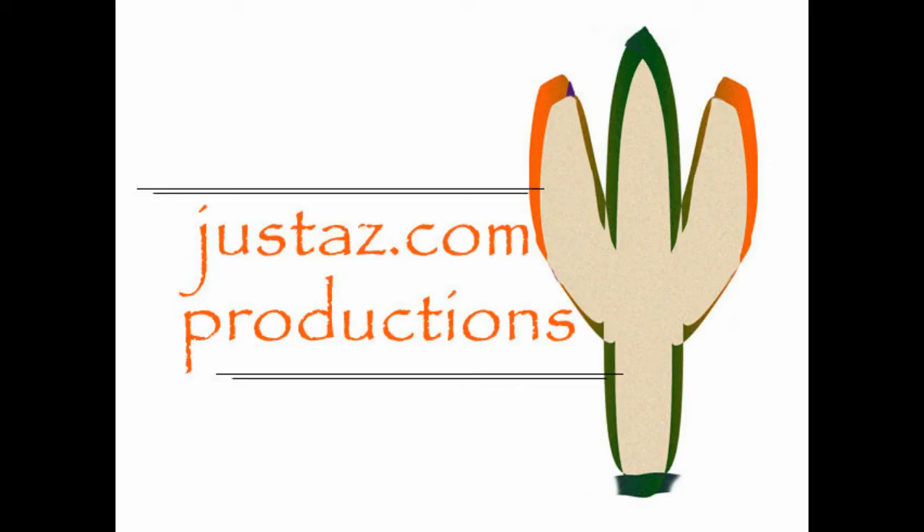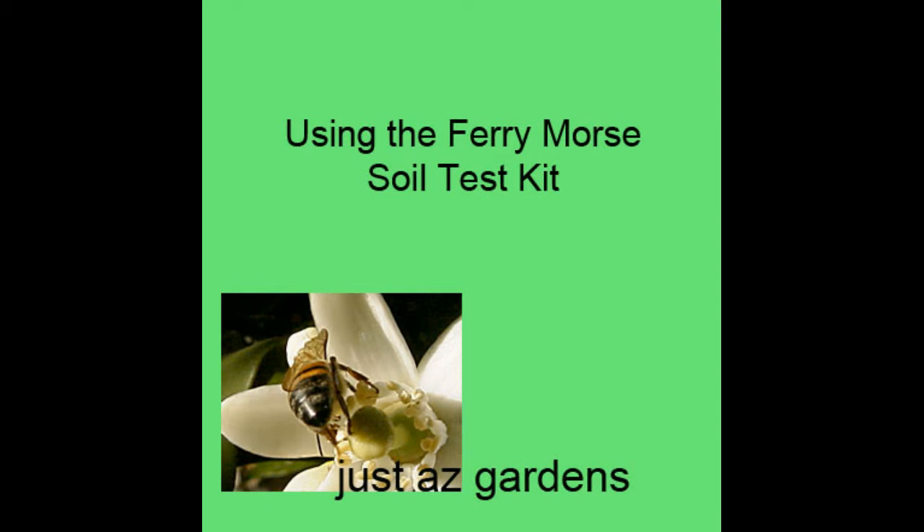JustAZ.com Productions with JustAZ Gardens using the Ferry Morse Soil Test Kit. We recently added soil to our garden beds and we're going to test the nutrient content of the soil using the Ferry Morse Soil Test Kit. We're going to show you how that's done and the results that we got.